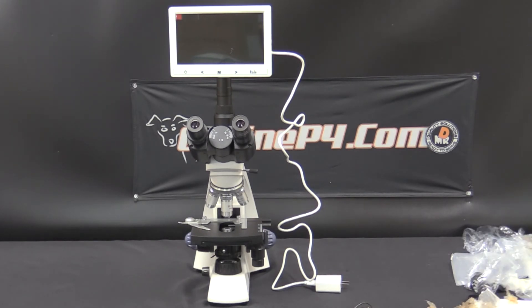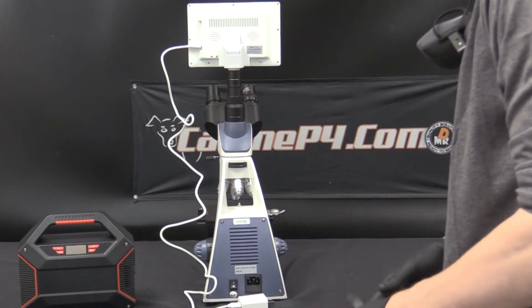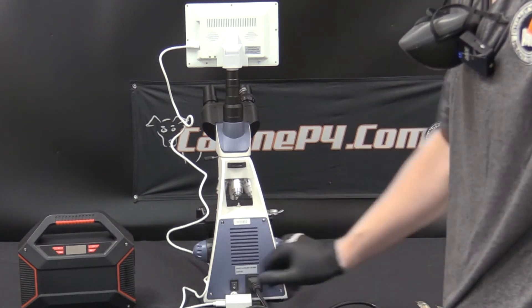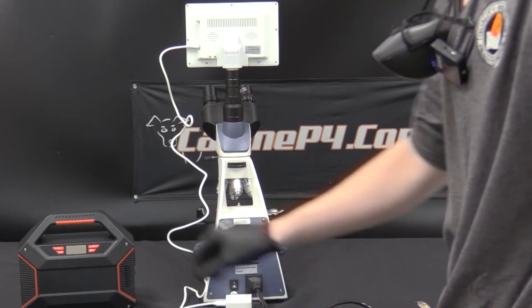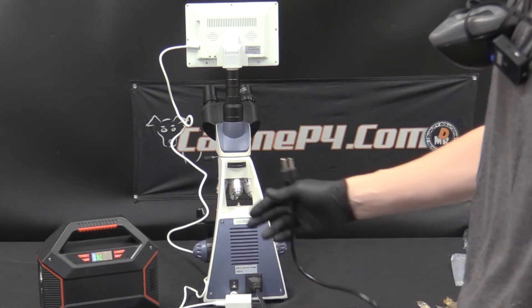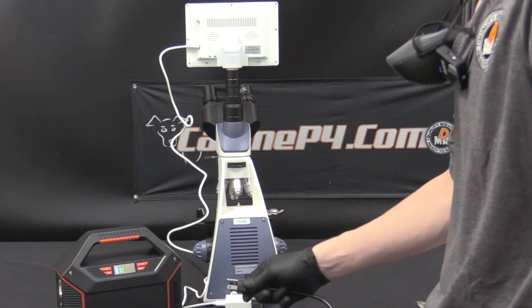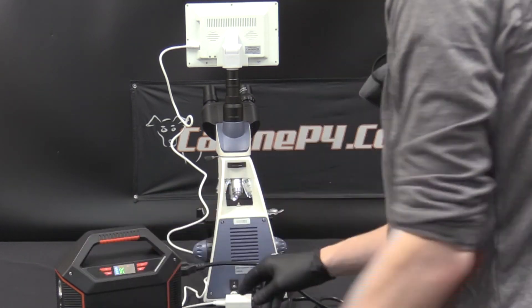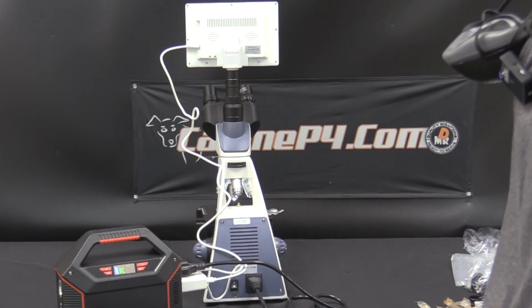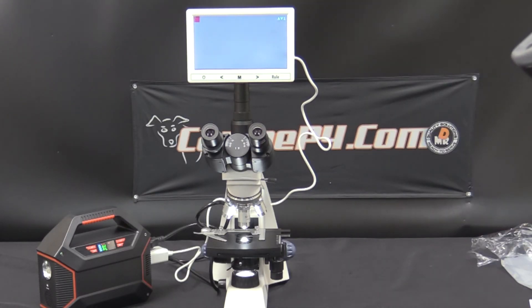Everything is now unpackaged and installed. Next, all we have to do is plug the microscope and LCD screen into a power source. Plug the power cable into the back of the microscope. Notice how the circle is the off setting and the line is the on setting. For demonstration today we are using our battery backup power supply, which will run your equipment safely for many hours of use — this can be found on CanineP4.com. You can also plug it simply into any standard wall outlet; it's 120 volt, 50/60 hertz. Now you are finished with the setup and ready to view slides and specimens.